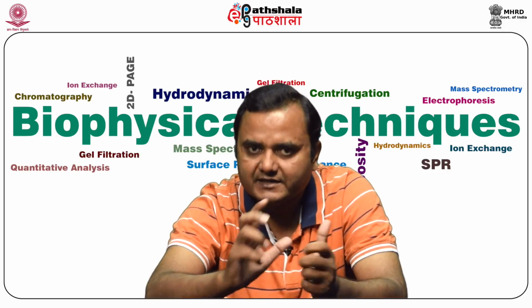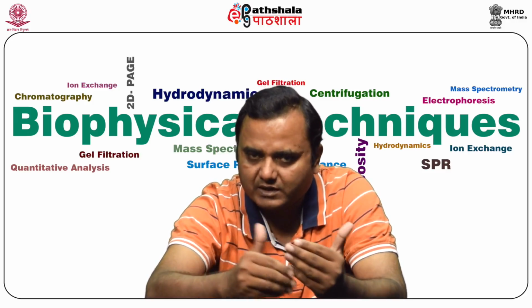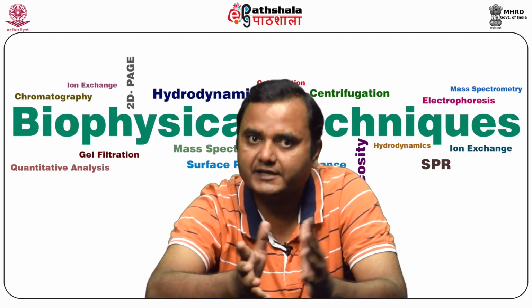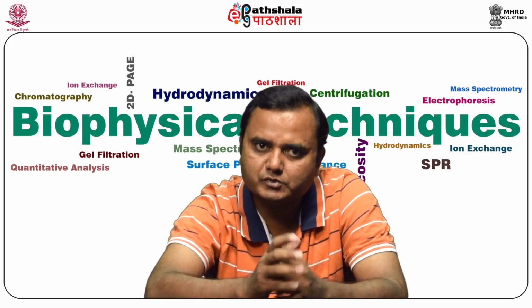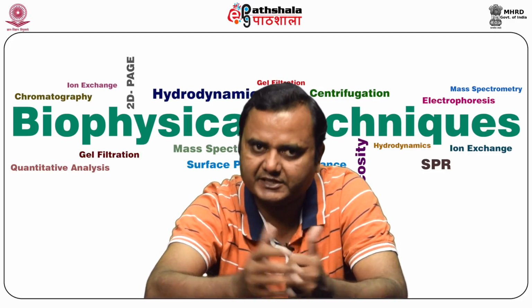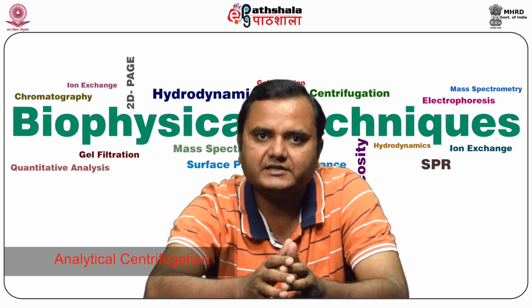Now, once you talk about centrifugation, it is classified into two groups depending upon the application. What are the possible applications? First is analytical centrifugation.